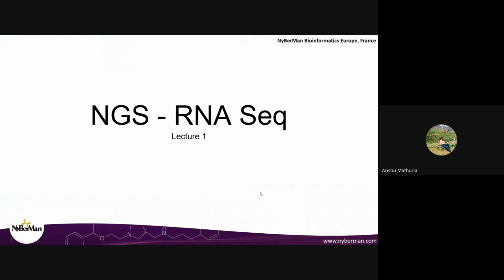So today I will be discussing majorly about RNA-seq analysis. And RNA-seq, like I've written as RNA-seq, it's basically RNA sequencing. So just we'll be talking about that. So RNA sequencing is one of the most important, and you can say one of the most used applications of NGS. So NGS here stands for the next generation sequencing.